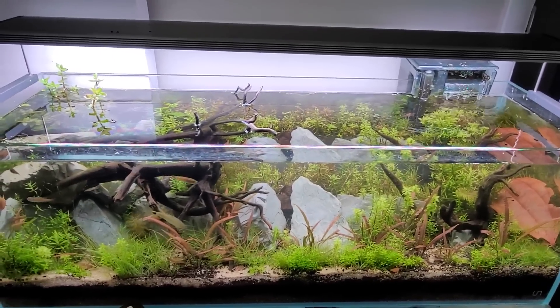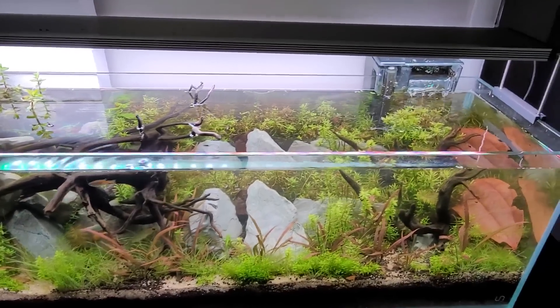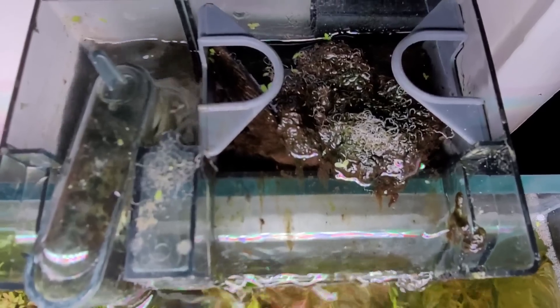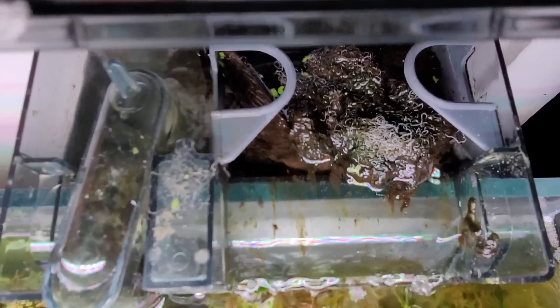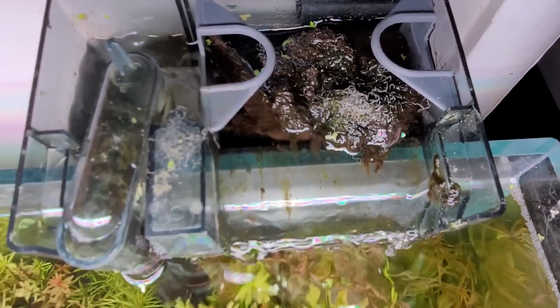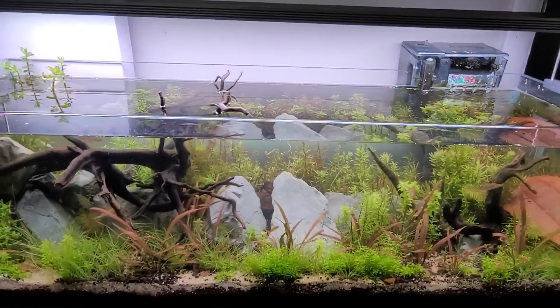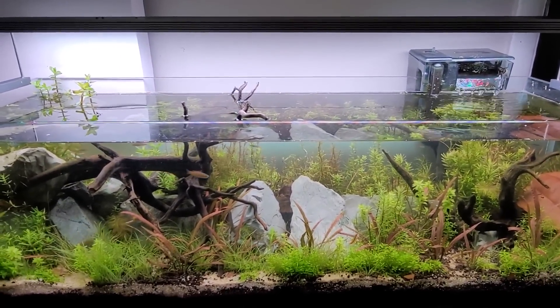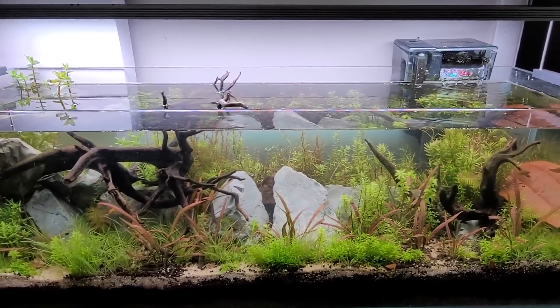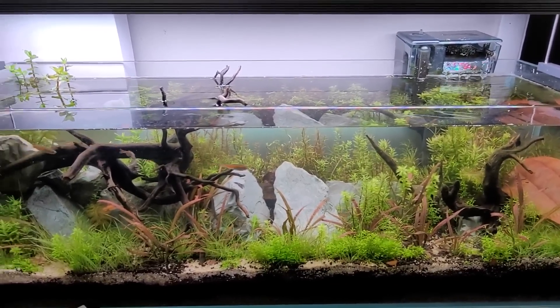We also have a tank that will be included that I think will be interesting because it's only three or four months old, but it was jump-cycled by using filter floss from an old aquarium. We took that out and put in new filter floss for all these hang-off-the-back filters — all either Marinelands or Fluval 30s to 50s. We're cutting a snippet of filter floss under the water level to see what's happening as water passes through. All of these tanks have zero ammonia and nitrites, and very low — near undetectable — nitrates in every single one of the six we're looking at.